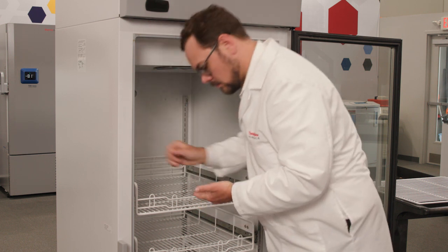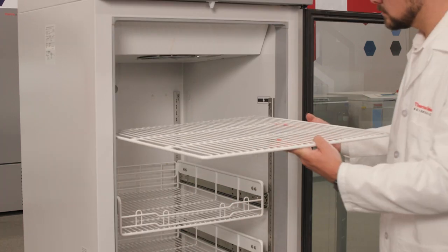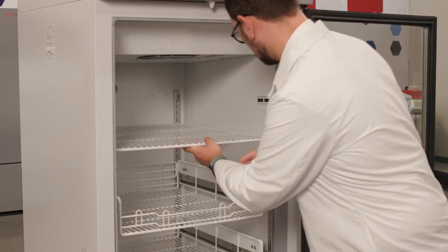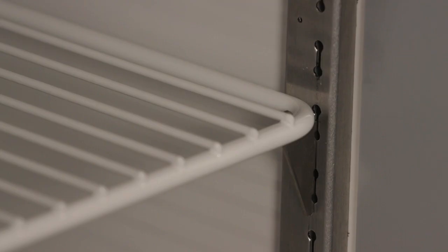Confirm your shelf spacing and then install four shelf clips for each shelf. With the retention bars facing upward, place the shelves onto the clips while being careful not to dislodge the clips in the process. Make sure that each shelf rests firmly on all four support clips.